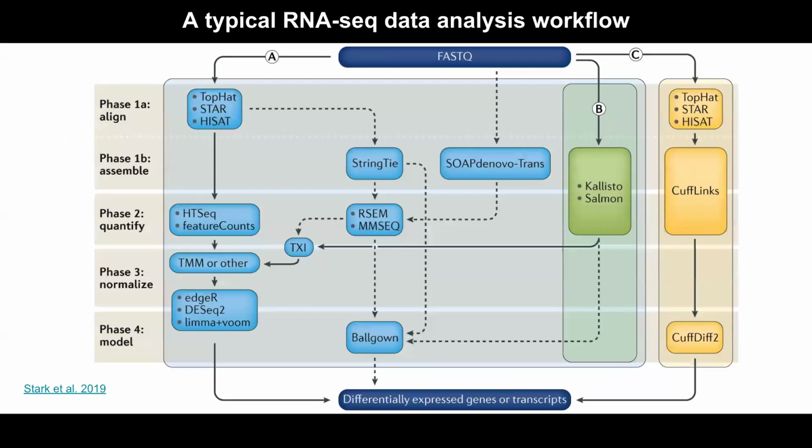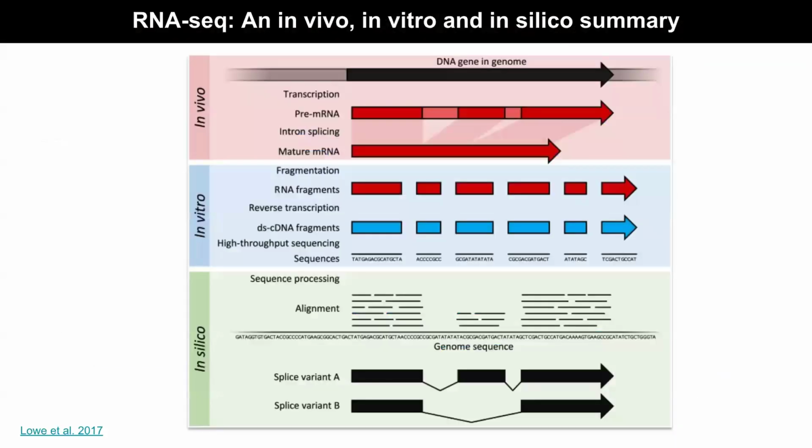Okay. So what does the data look like, right? So the data looks like this: gene 1, gene 2, gene 3, up to 20,000. Again, it's not the exact number, nor does it matter. Then you sequence one sample, right? So let's call it S1. This is a column vector. This is 5 copies, this is 10 copies, 15 copies, 0 copies, 1 copy. So it's a vector which quantifies how many copies.